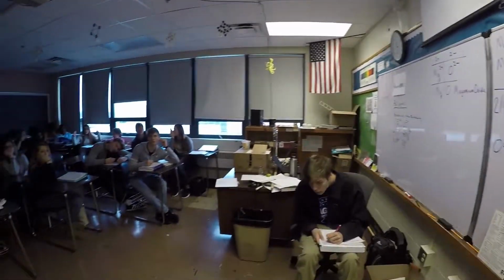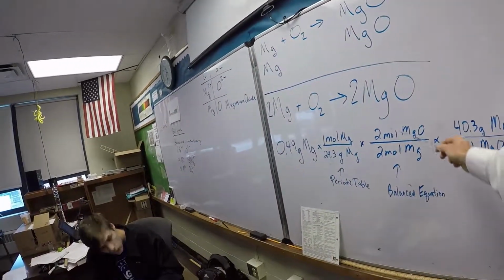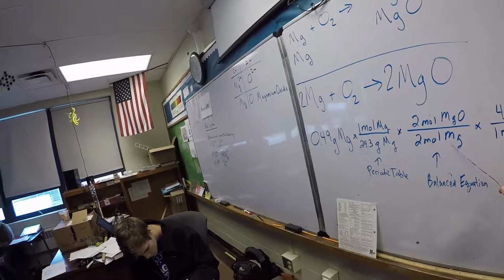Now I have to use this information. This just isn't for fun. This is called the balanced equation. It is going to be used to allow me to convert magnesium to my ash. I'm going to burn this today and make an ash.